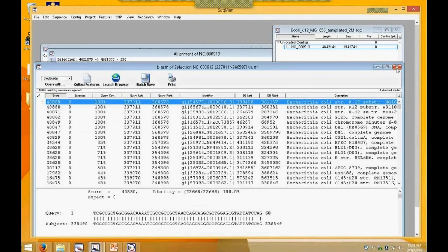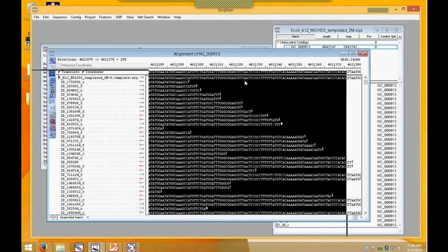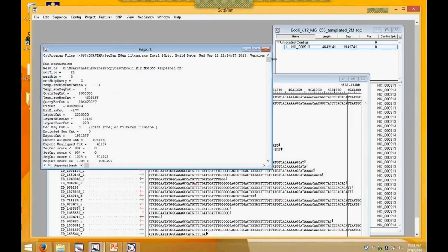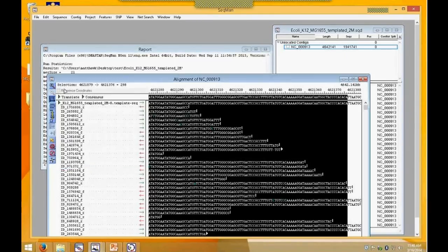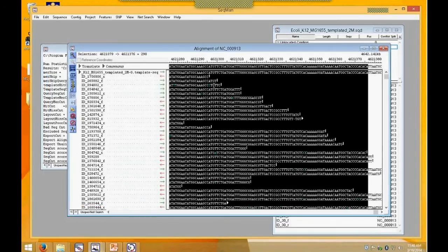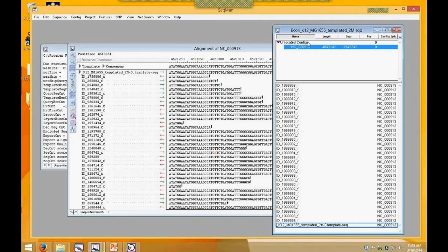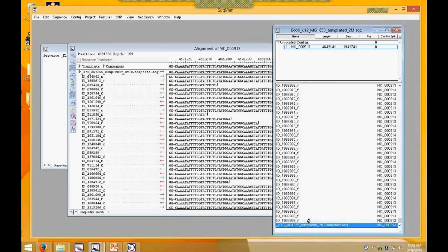I'm going to try that again. I might have gotten my, let's see here. I think I can get it back here. Excuse me. Oh, I think I know what's going on here. This project has an unmarked reference right now. All right, so I just marked my reference.